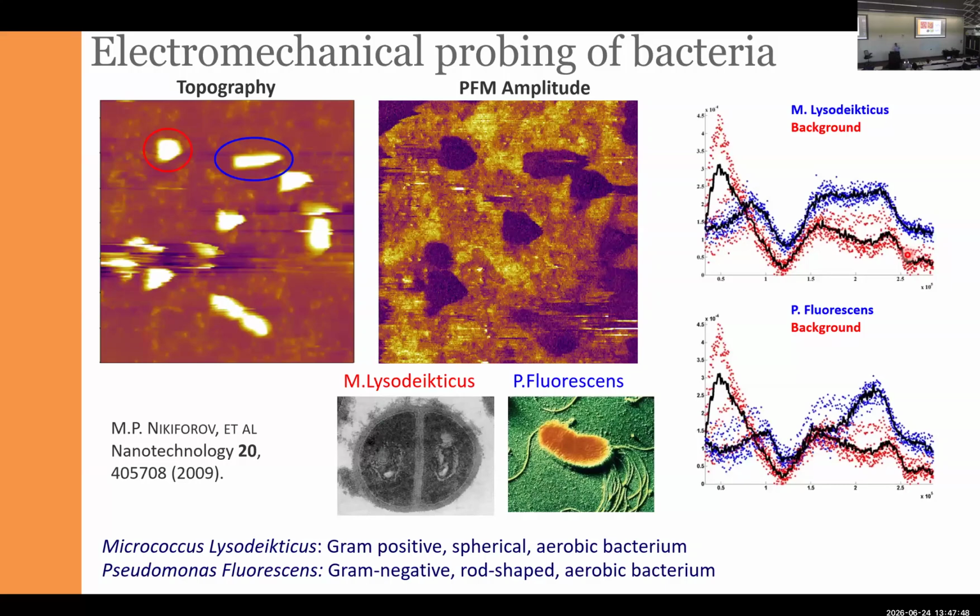The answer is it can. What we can do is, for example, we don't necessarily understand what the spectra mean, but we know that getting the high resolution image takes time and effort. But if we take a high resolution image, we can recognize what we are looking at based on shape. At the same time, we can take very sparse spectral data. So we take very few spectra, we cannot recognize shapes.